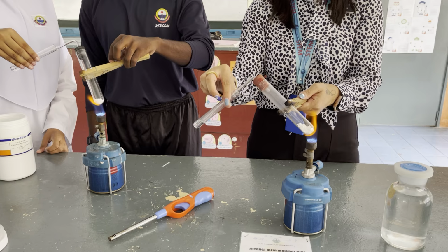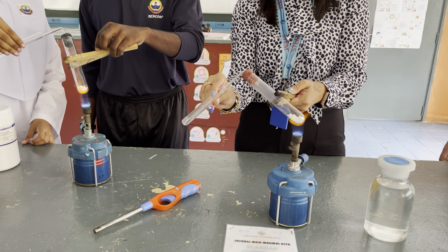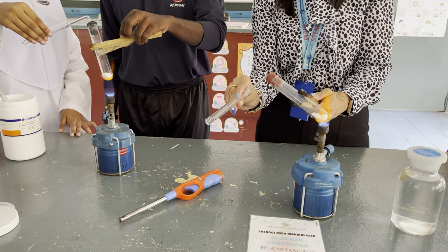What color was the initial color of the lime water? Anybody know? Clear. Clear, very good. Okay, let's see whether it remains clear or not. Okay, you just have to look at the lime water.